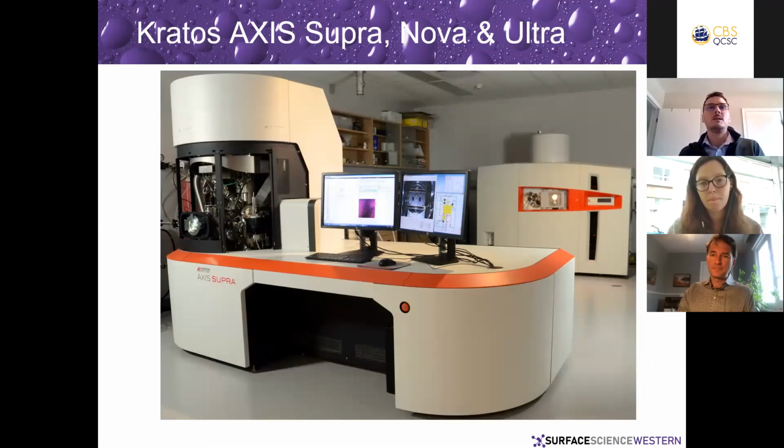And it also has the latest gas cluster ion source, which allows you to do depth profiling and sputtering and cleaning of materials without really damaging them or changing the oxide properties of them, as opposed to the older argon ion sources, which were a monatomic ion source, where you always had to worry. The ion beam would reduce materials that you were looking at and change the chemistry of those materials.